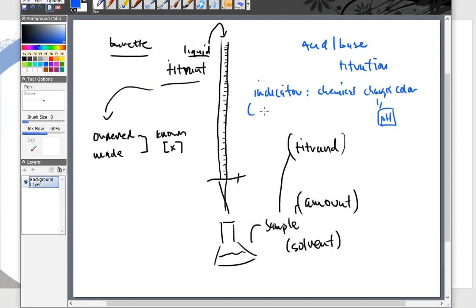So out of the indicator family, folks, there's probably 100 or more of these indicators that we can choose from based on the type of titration that we do. Phenolphthalein is going to be the most common, and it seems like phenolphthalein will be the only indicator out there because that's the only one that we get you to use over and over and over again, but that's a lie. Indicators, there's tons of choices. They're used in different types of titrations depending on the samples that I'm given to a laboratory or from a laboratory. All right, so indicators, tons of different choices. And we actually have an indicator chart in the laboratory, at least at one point we did. Now, the indicator is going to give me a pH color change.